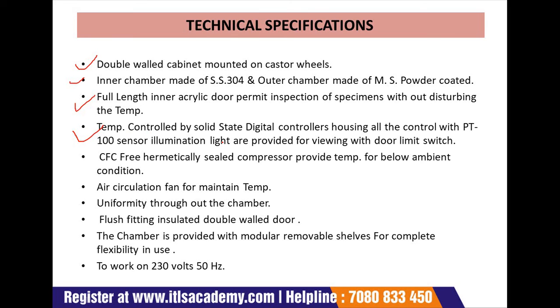Next is the temperature controller, a solid state digital controller housing all the controls, with a PT 100 sensor. Illumination light is provided for viewing, with a door limit switch.